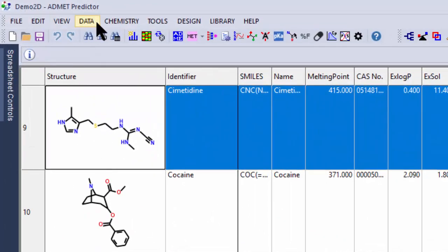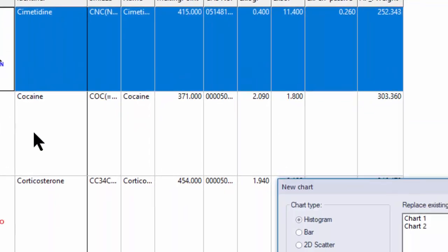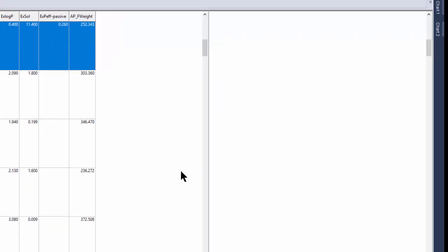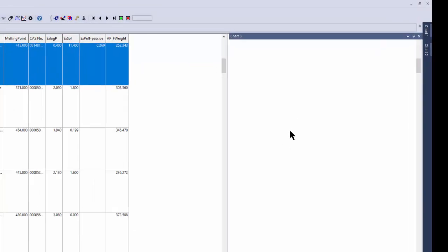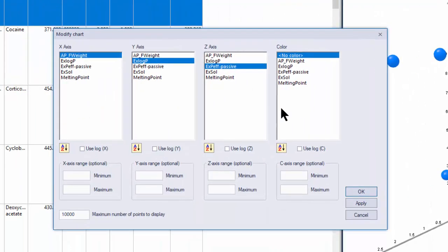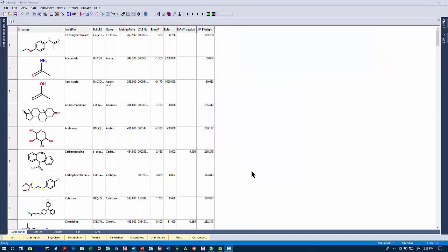You can also add graphs under Data, Add New Chart. If I specify a 3D chart, it's just going to add the chart, and then under this control you can specify what you want to see in that plot.